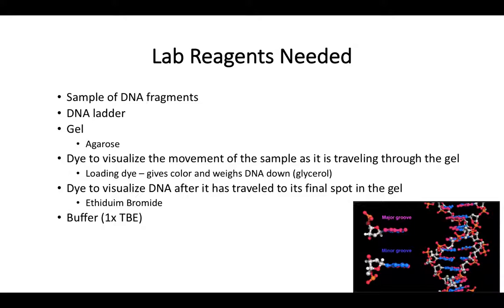That dye will help us visualize the movement of our samples as they travel through the gel. So it gives it color, basically, as it weighs down the DNA. But our ladder does not need a loading dye, because it already has a tracking dye inside of it, right? But our samples will need that loading dye.